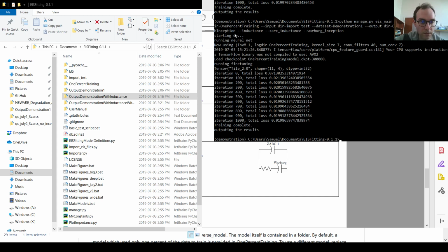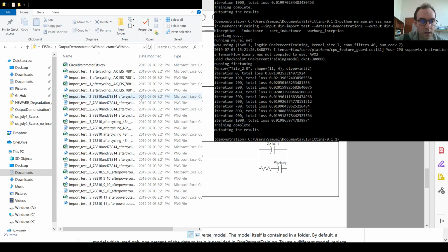For example, now it is done, and you can see that we have a new fit, and we can take a look at it.